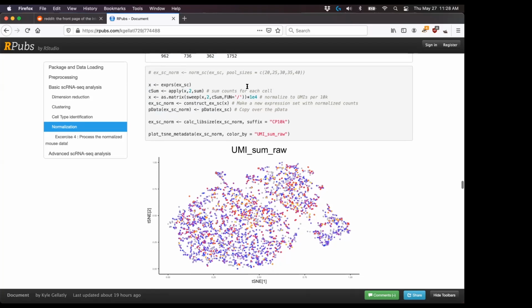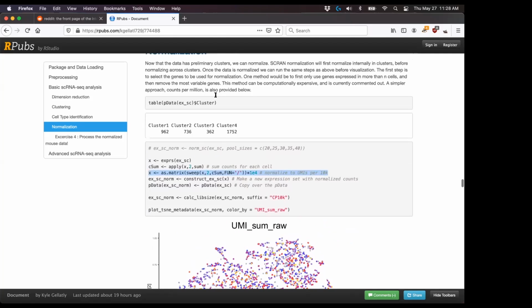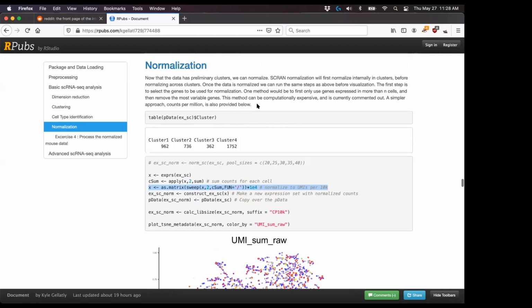In the data that we're looking at today, the normalization doesn't seem to make a large difference. The mappings that you get out on normalized data are very similar to the mappings you get on the unnormalized data, but there are cases where this turns out to be really important. After you run your normalization, you might see a whole new cell type that you didn't even see before you had normalized it. So that's the context and the why of doing the normalization.